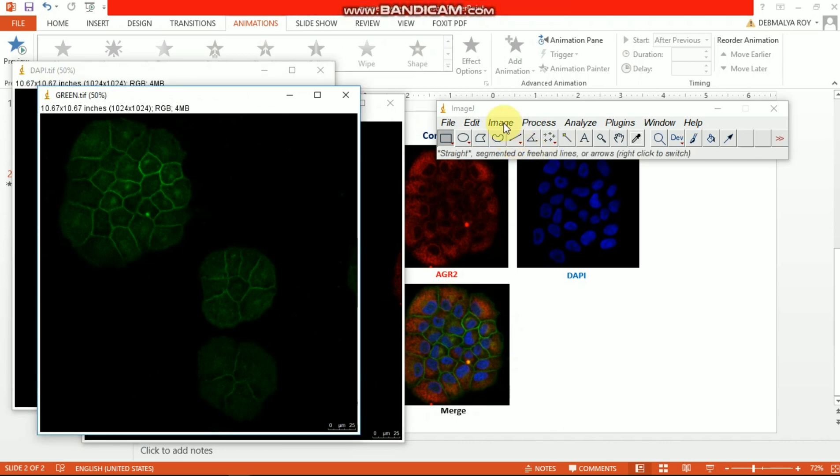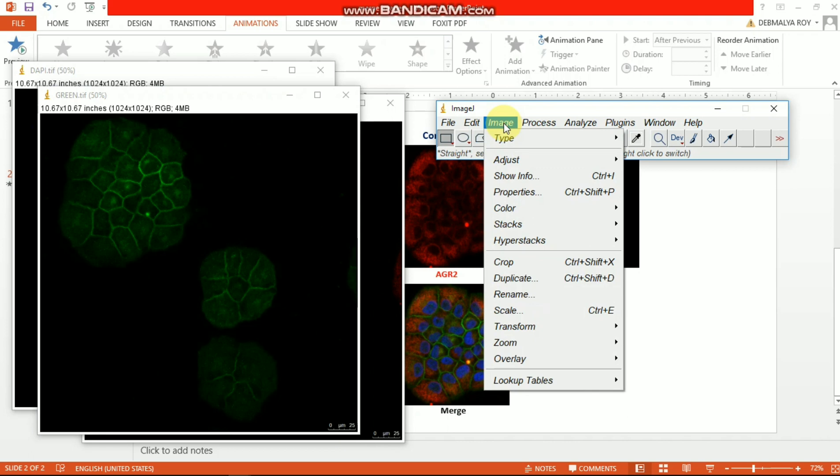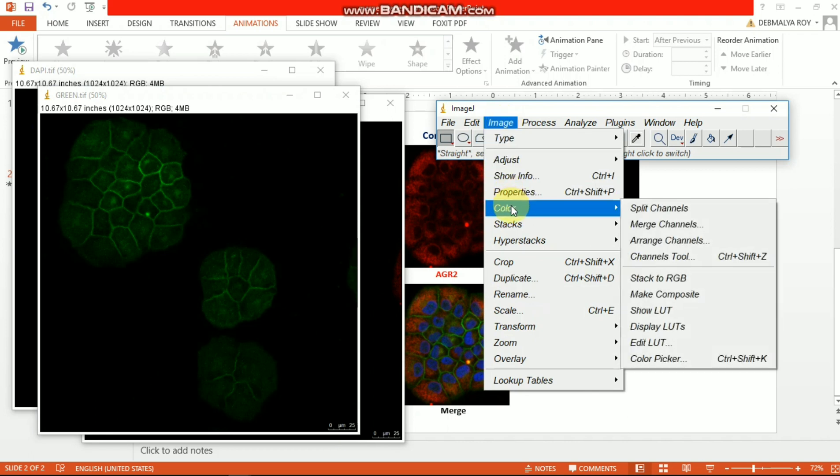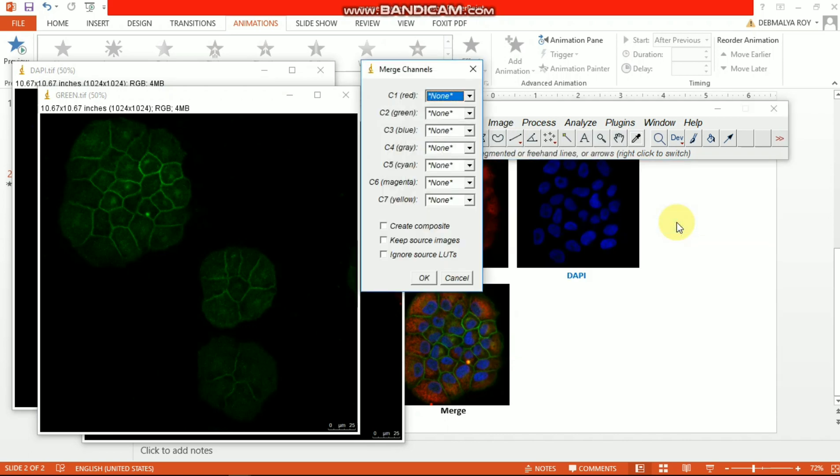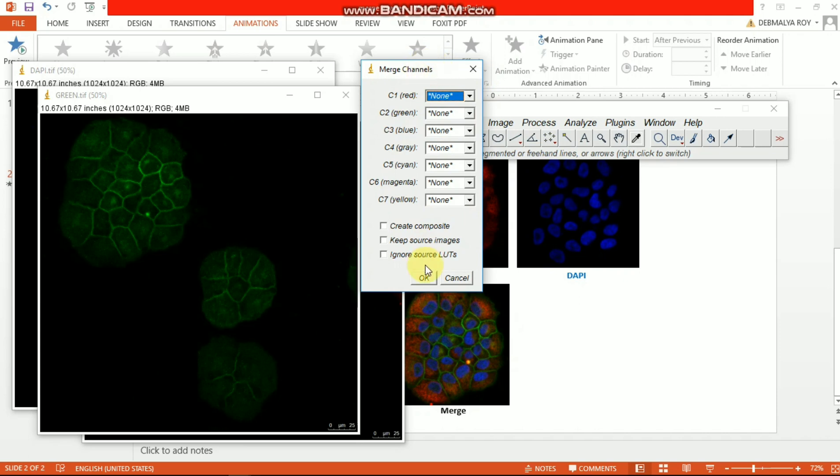Under the Image button you can see the Color menu, and under Color you can find the Merge Channels. So you need to click this one. After that, a pop-up window will open and then you need to select the right and proper way.